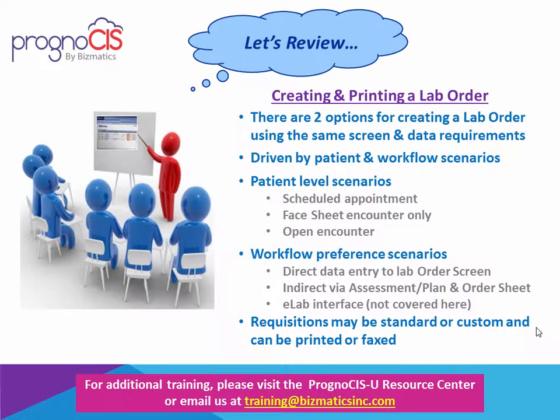With regards to the hard copy requisitions, these come standard with your database, or you can customize them through local preferences or through vendor-specific needs. And once the requisition is in the system, it can be printed or faxed to the vendor.